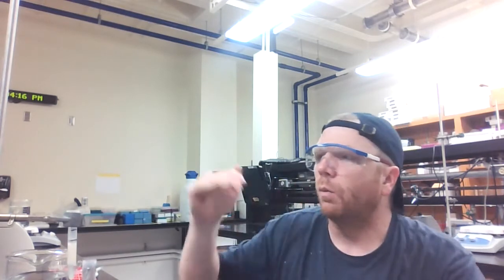What I saw is fraction number 18 with a negative 0.013. Now, does that make sense? Okay, let's think back. Fraction number 15 was the last one that I collected. And then I said, now what I'm going to do is just collect everything that flows through my column. So fractions number 16 and 17 are the result of basically getting the rest of that wash/lysis buffer out of my column. Fraction number 18 was whenever I had added my elution buffer.